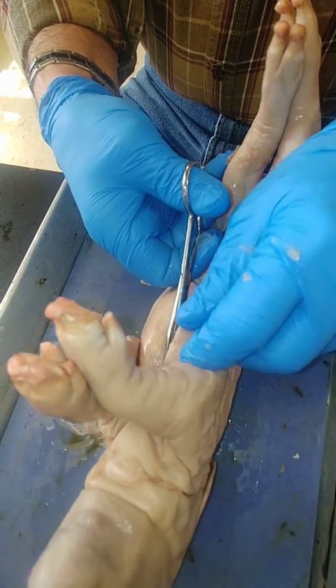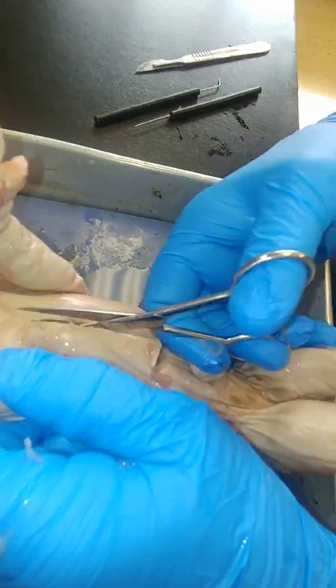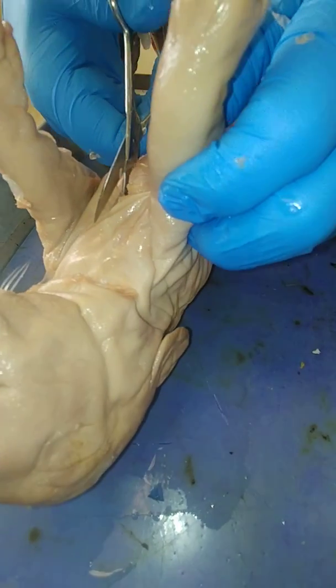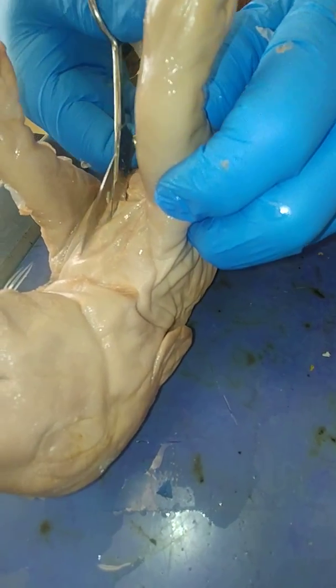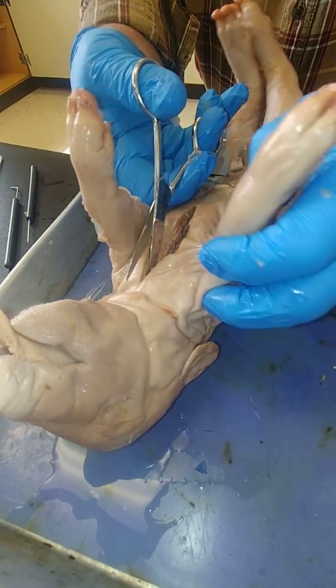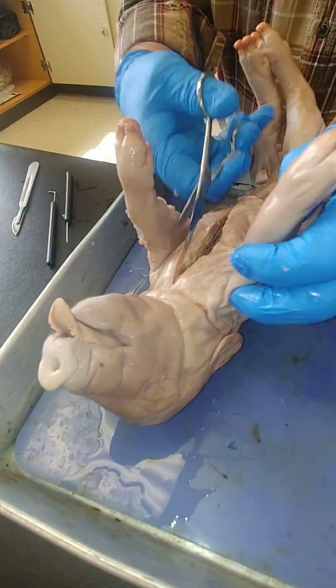And if you notice, I'm cutting with the scissors. I'm going right through the sternum now. And with the fetal pig, the bones are pretty soft. They haven't completely solidified yet. So things cut fairly smooth. Okay, so I made my cut down the mid area.